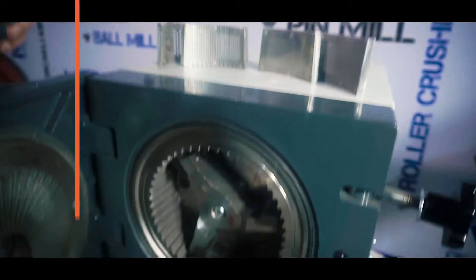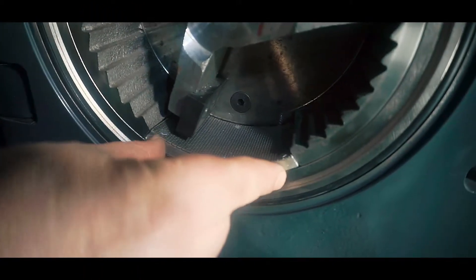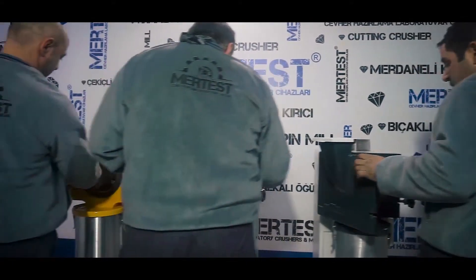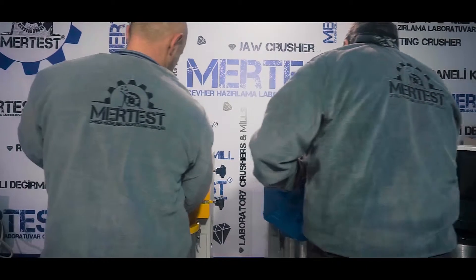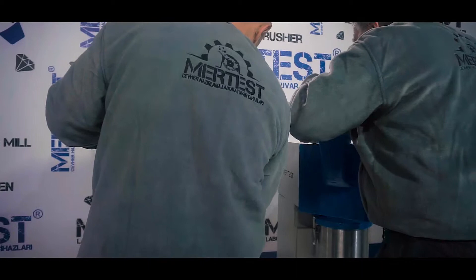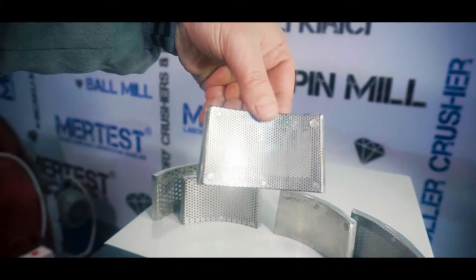The LB160 operates as a micronized grinder when operated with a 400 micron cartridge sieve, achieving minus up to 100 microns. In the same way, when a sieve with a diameter of 2 mm is applied, granule milling with a size of minus 1 mm can also be achieved.